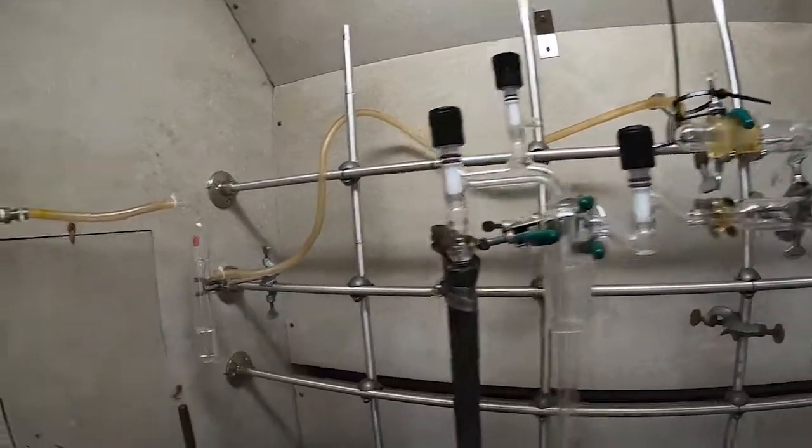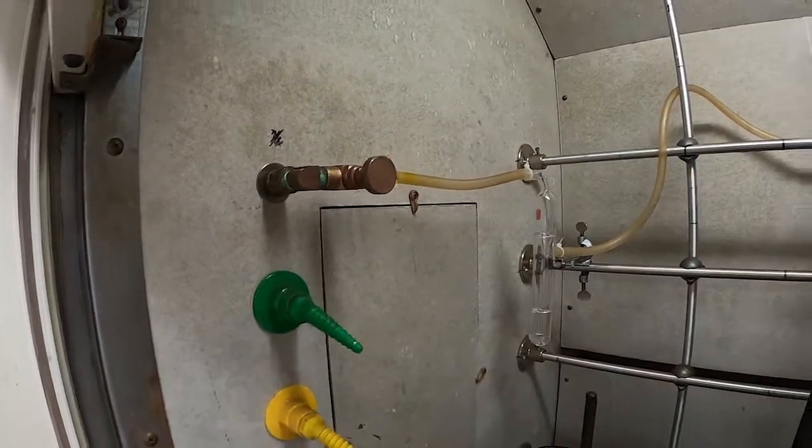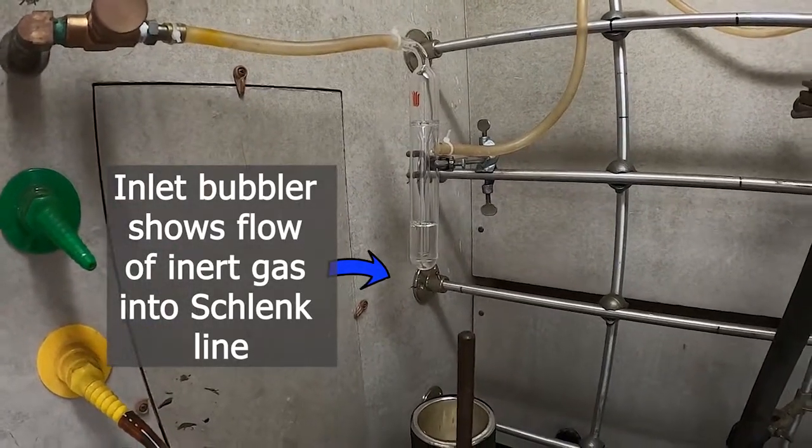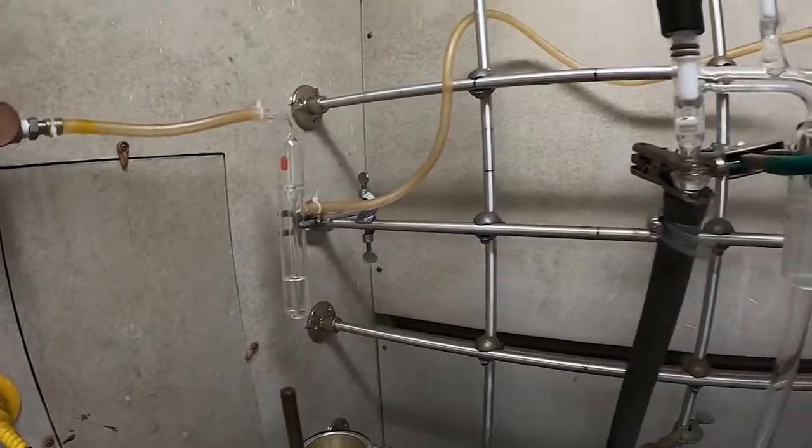The inert gas comes in usually through a tank or a dewar of some kind, nitrogen. And this bubbler here is used to indicate the flow and also prevent backflow of the gas through the system.